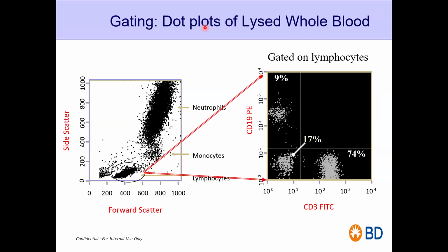A cluster doesn't define the size. A cluster is like a herd of animals, they stay together in a group. It's the same with cells: the same kind of cells stay in the same group, the same cluster. I hope I have explained it right. If not, tomorrow you can write down this question and we can discuss it face to face.